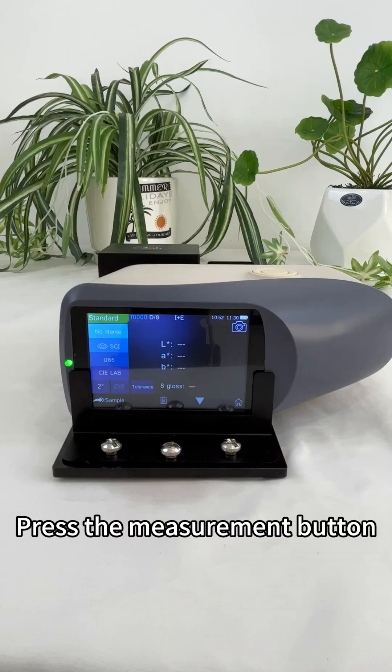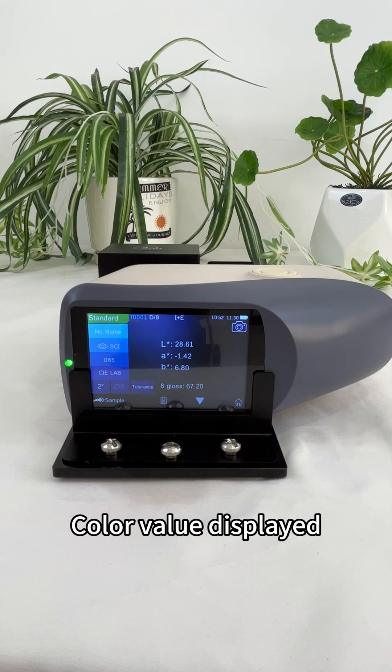Cover the cover plate and press the measurement button. The color value is displayed.